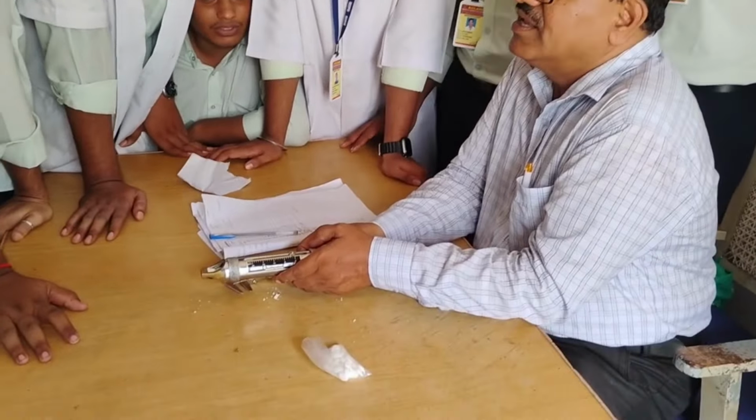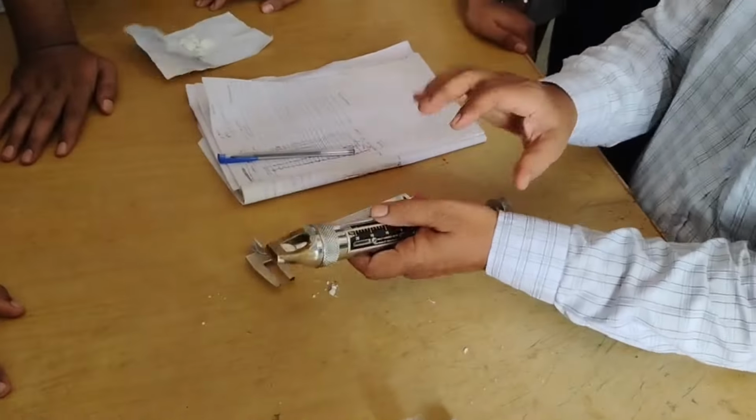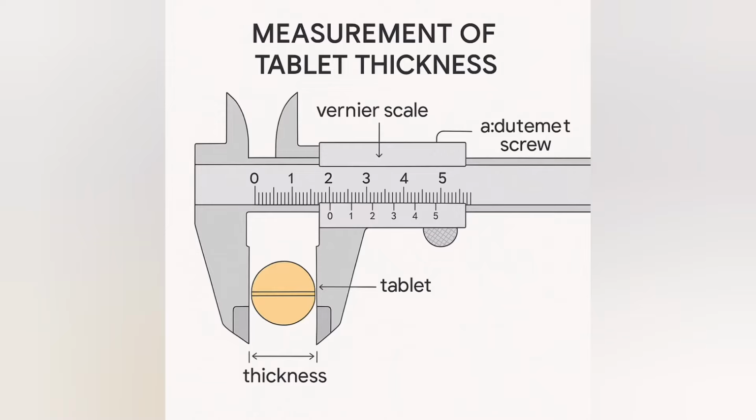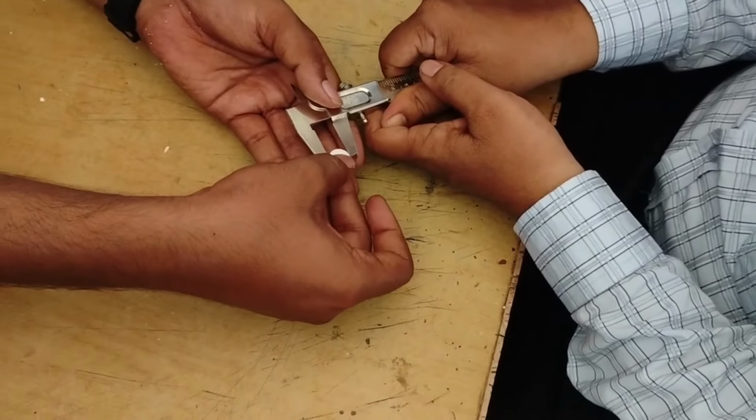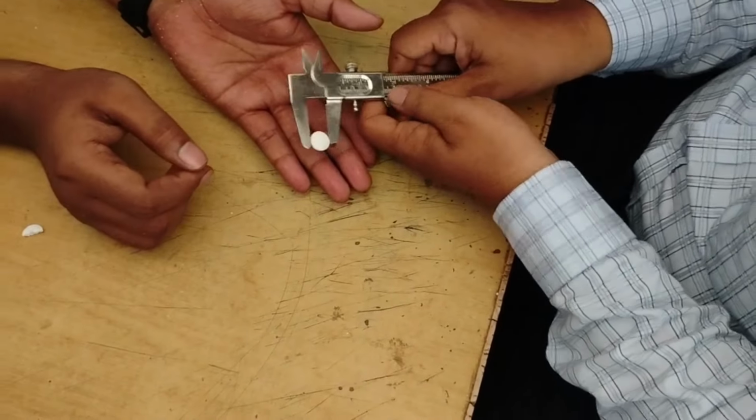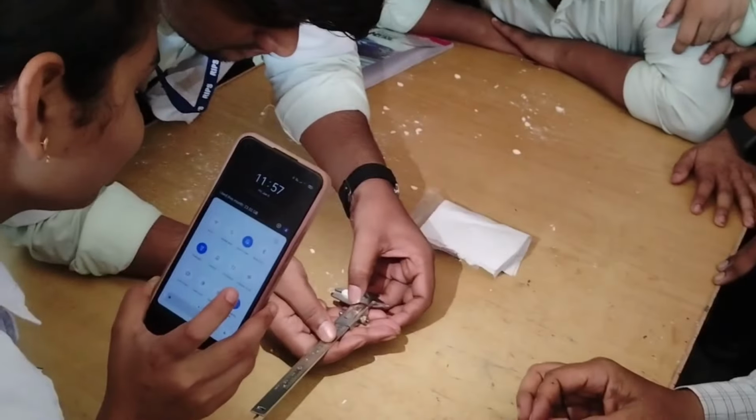To test the hardness of a tablet, the Monsanto tester and Erweka tester are used. The principle of measurement involves subjecting the tablets to an increasing load until the tablet breaks or fractures. The load is applied along the radial axis of the tablet.